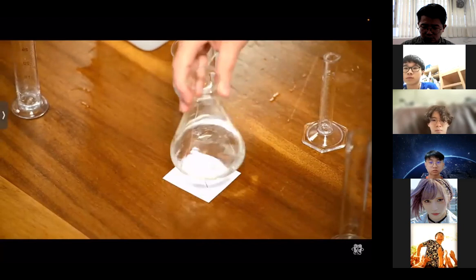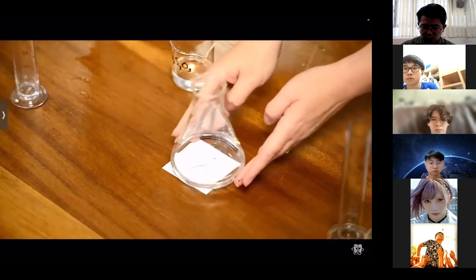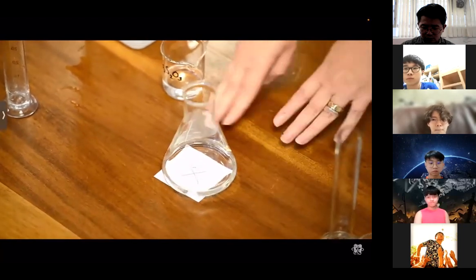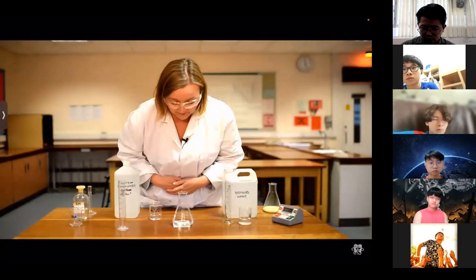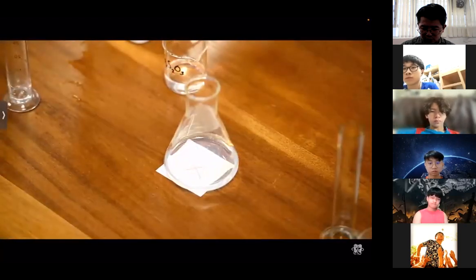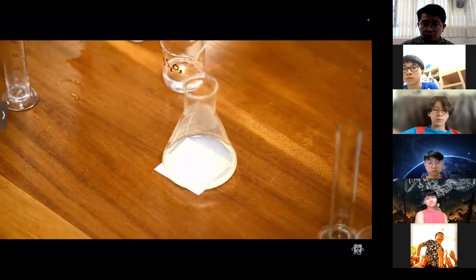Pour the acid in, start the clock, give it a little swirl. And I'm keeping everything else constant. I've got the same volume of solution, the same cross, and it's the same person observing it. I'm going to watch directly from above until I can no longer see that cross. As you're looking down into the flask, take care not to breathe in the sulfur dioxide fumes that do come off, because it can make you cough.